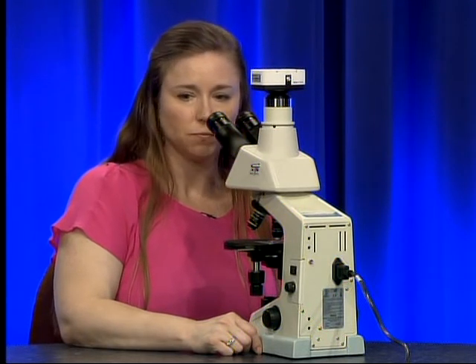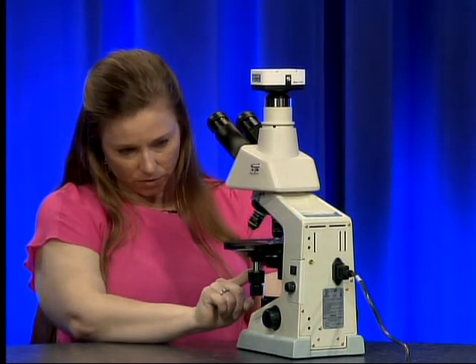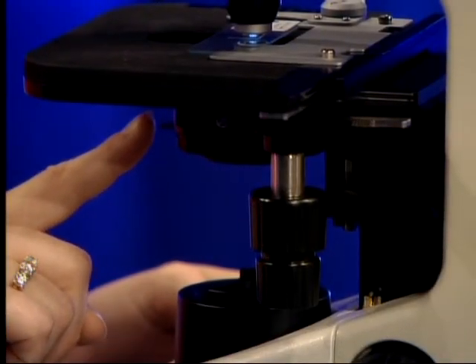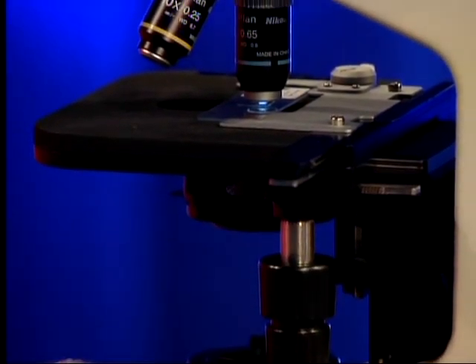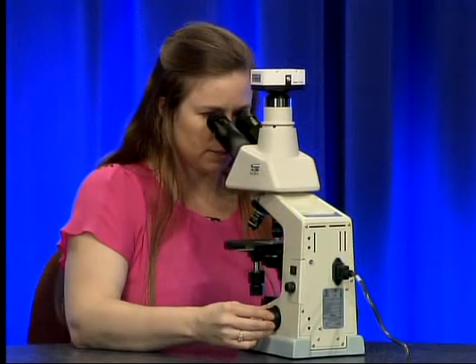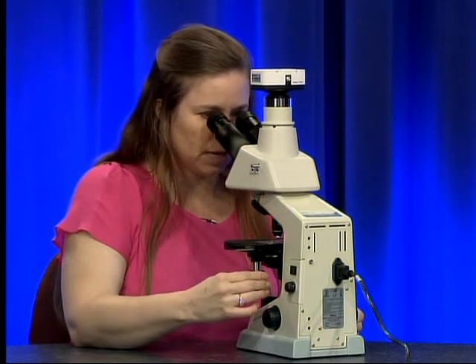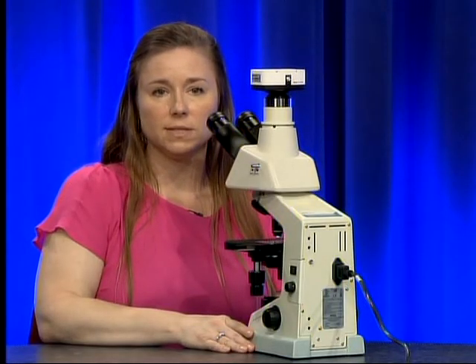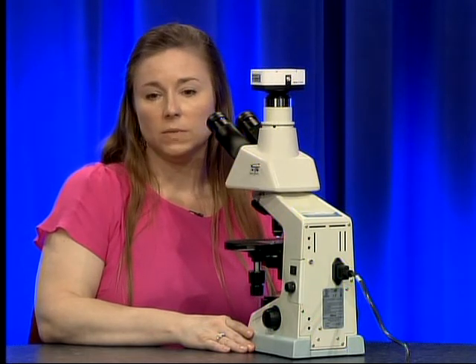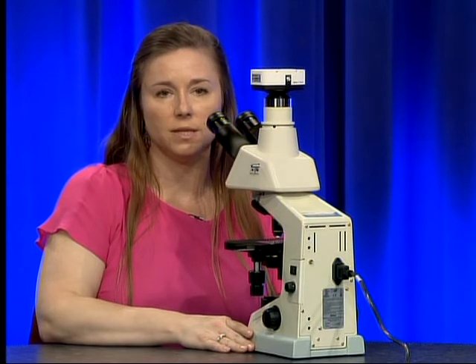When you have the 40x objective in place you may also need to change the condenser setting to the 40 mark to allow a little more light into your microscope. Once you have seen what you need to see, switch back to the 10x objective and continue scanning the slide. To properly assess a wet mount slide you will need to stop 10 different times and swap to the 40x objective — ensure that you are looking at 10 high-powered fields to properly assess each slide.